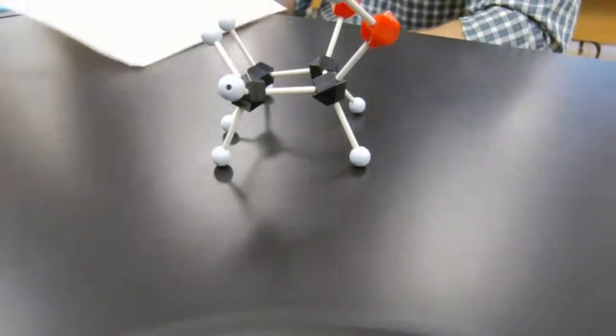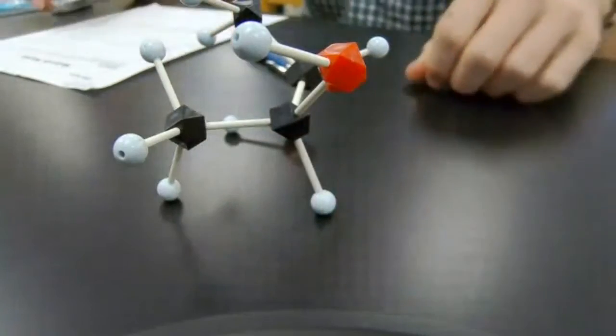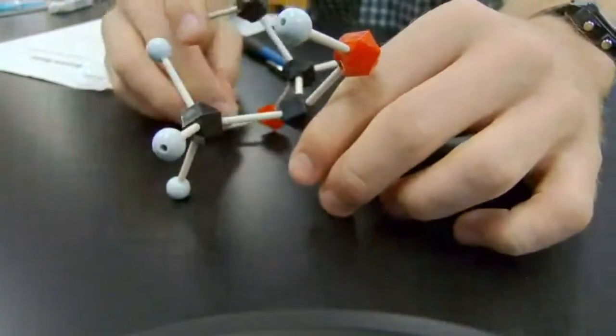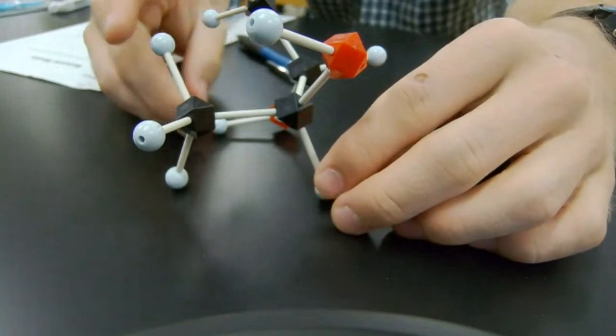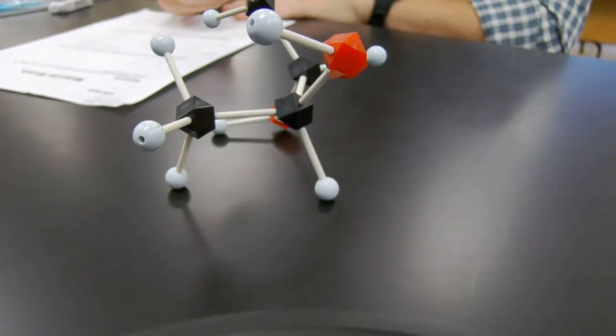All right, let's look. In the top left of the picture frame, there's a little icon that if you hover over it, it says build. I click that, and it gives me a page. On the right-hand side, I get to pick what type of atom I want to add to my structure. I'm going to put a carbon on the page by double-clicking it, and I'm allowed to rotate that carbon. There it is, a tetrahedral carbon.